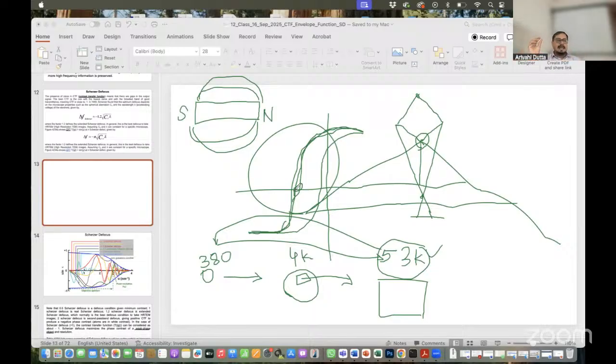When I'm talking about electromagnetic lens, you just have a button, you can rotate it easily, and that is why from low mag to high mag you can easily jump around. If you just consider the glass lens, it is always taking some time, right, to take out one glass lens, put in the next one, and then stabilize, then you are imaging. So same thing you do here.